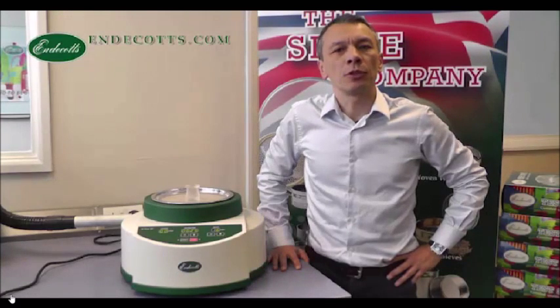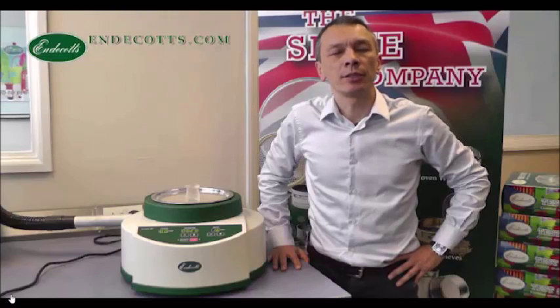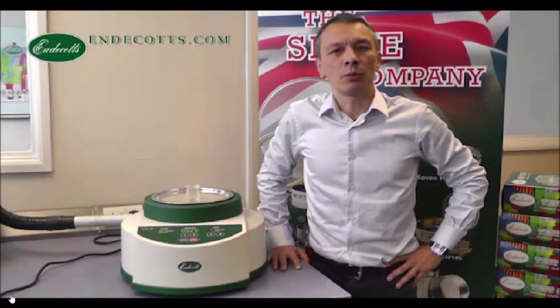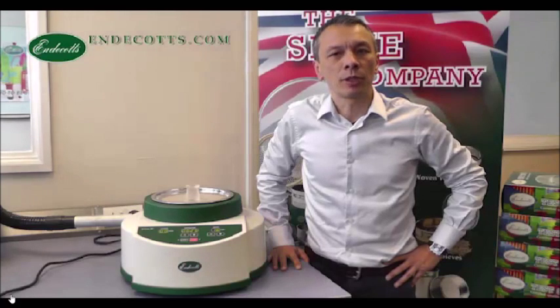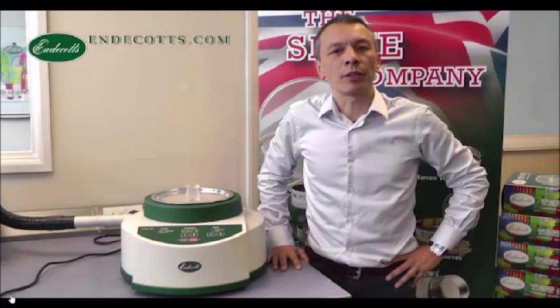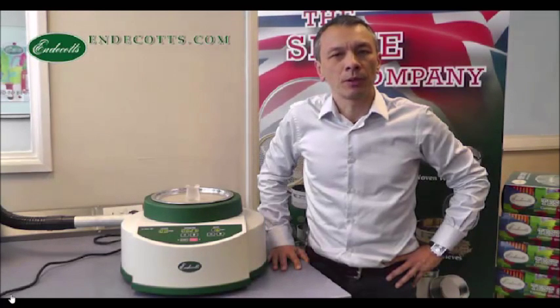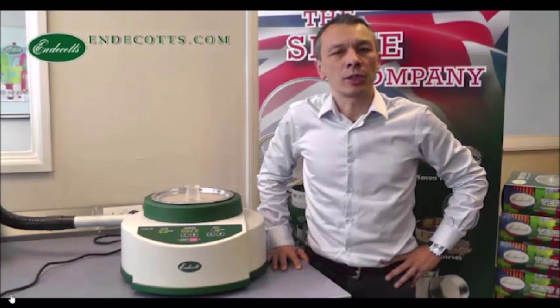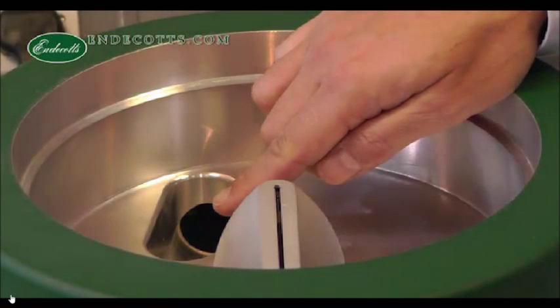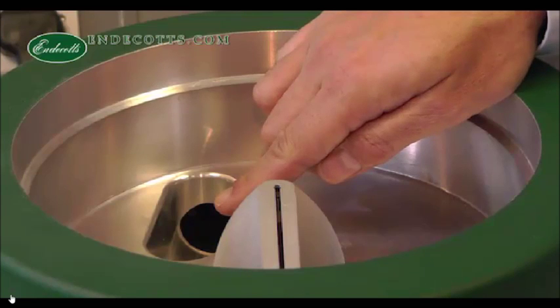Here we have prepared a sample so that you can see what happens in the AirSizer 200. The AirSizer 200 is a sieving machine which is able to sieve finer particles than a vibratory sieving machine. This is due to the fact that it works with under pressure, which is generated by a vacuum cleaner that is attached to the AirSizer. The vacuum cleaner creates an air stream which sucks air from the sieving chamber and therefore helps the particles to be sieved and pass through the mesh.